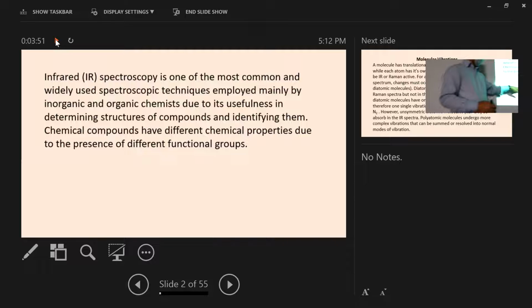So if you take both analyses, just using only one infrared spectrum, you can confirm whether the molecular structure is this or this. That is also possible if we use the fingerprint region of the infrared spectroscopy.